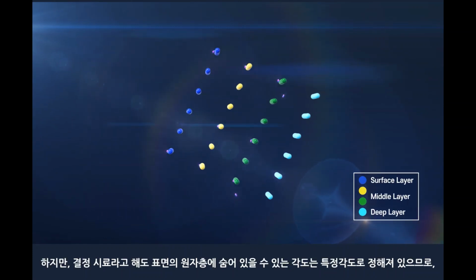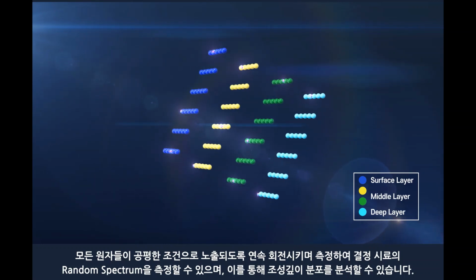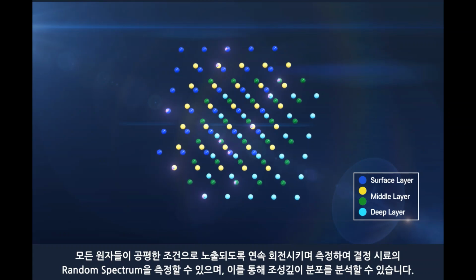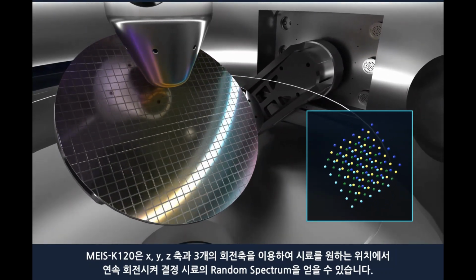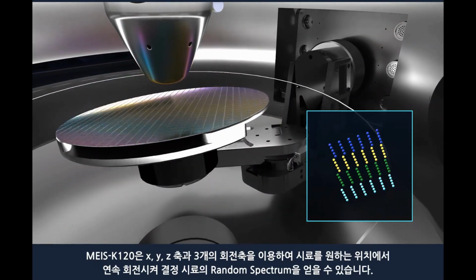However, even for crystal samples, the angles at which the atoms of the crystal can hide are limited to a few angles. Therefore, if the crystalline sample is continuously rotated at a certain angle, all atoms are exposed to the incident ions with the same probability. Thus, a random spectrum of the crystal sample can be obtained. MEIS K120 can acquire a random spectrum of a crystal sample at a desired position by continuously rotating using the X, Y, Z, and 3 rotation axes.